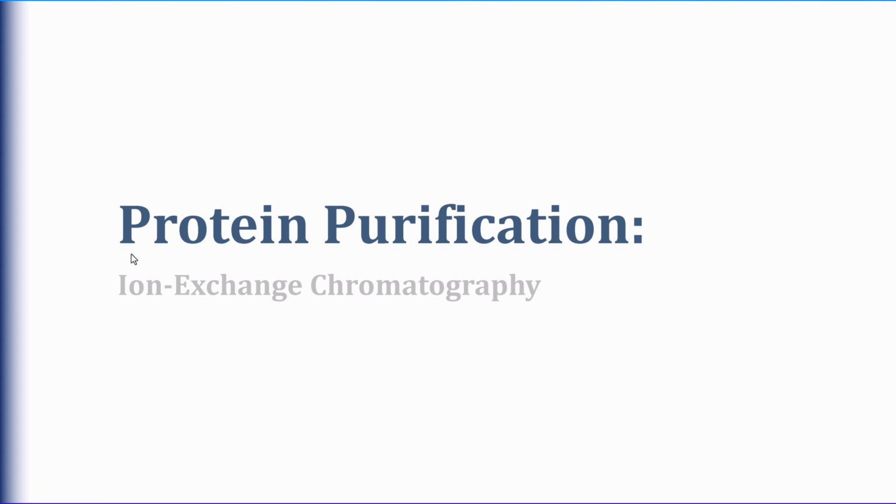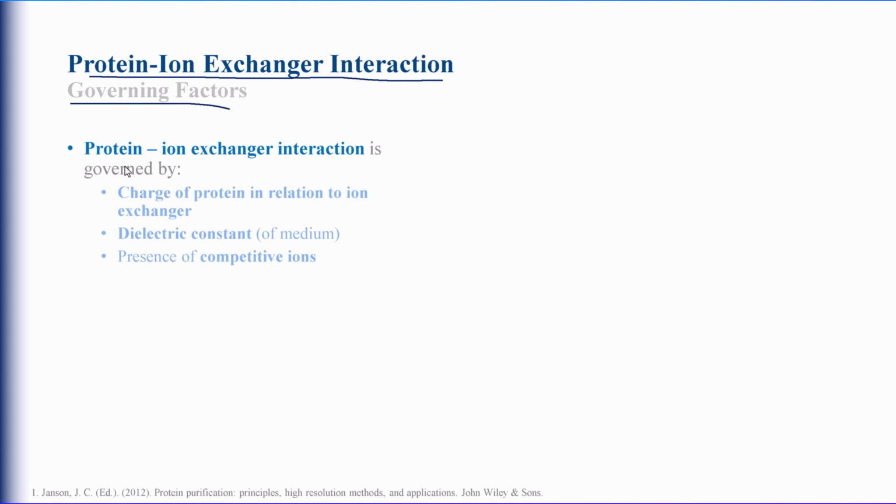Hello, everybody, and welcome to this discussion on protein purification, whereby I'll be discussing ion exchange chromatography. So let me begin by discussing some of the governing factors for protein-ion exchanger interactions.